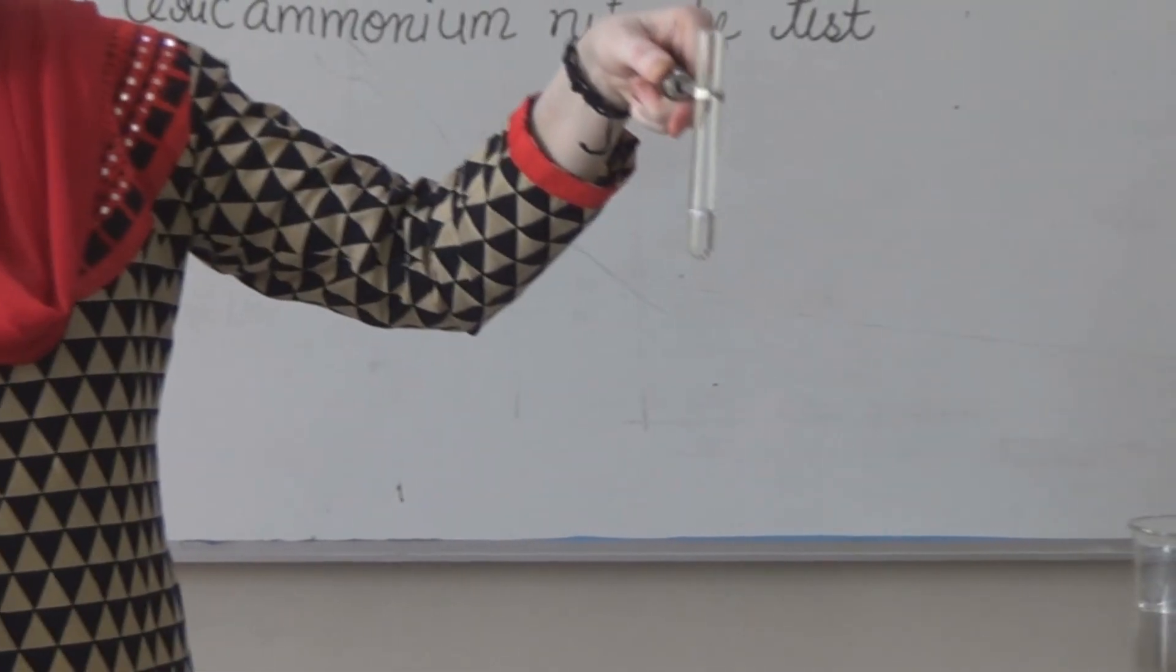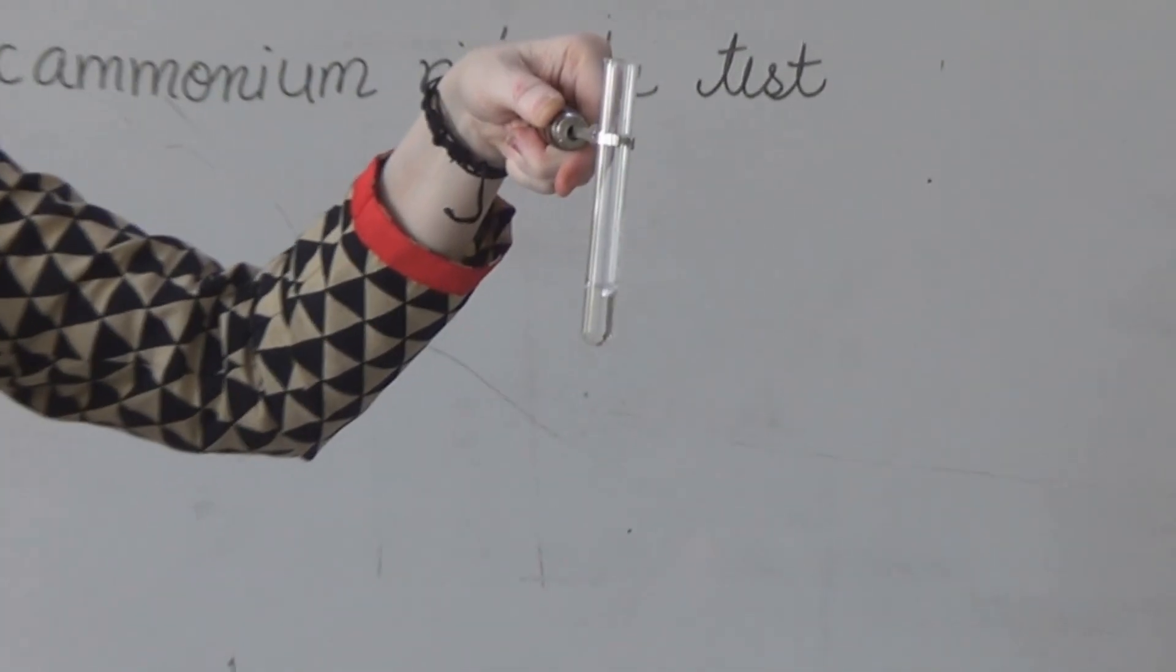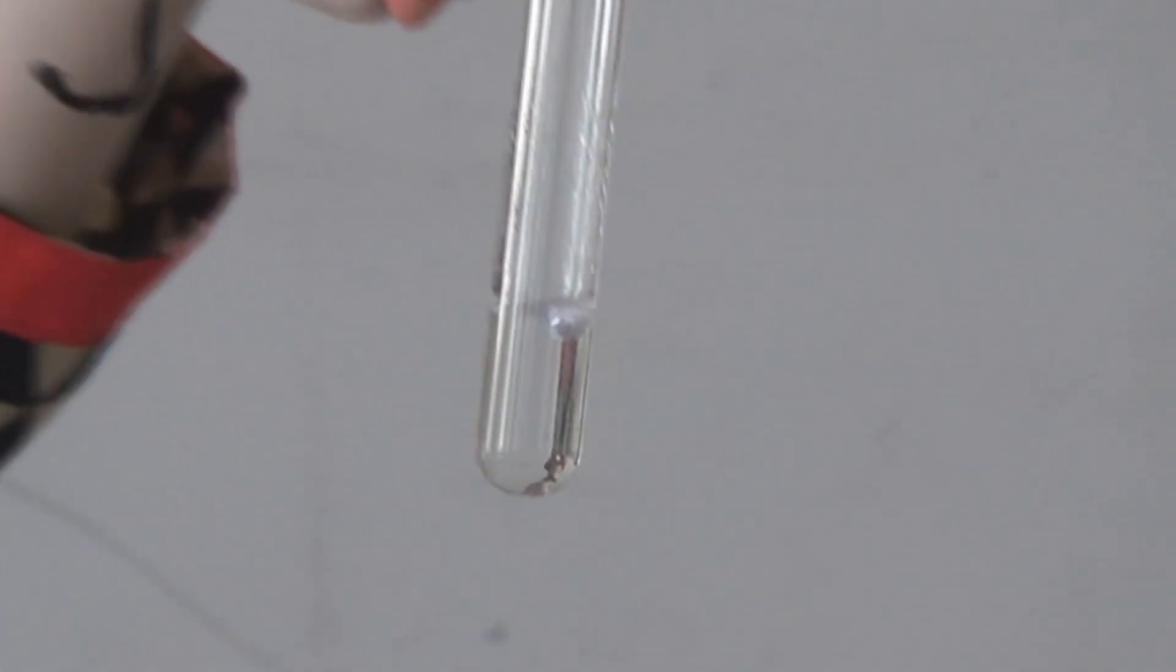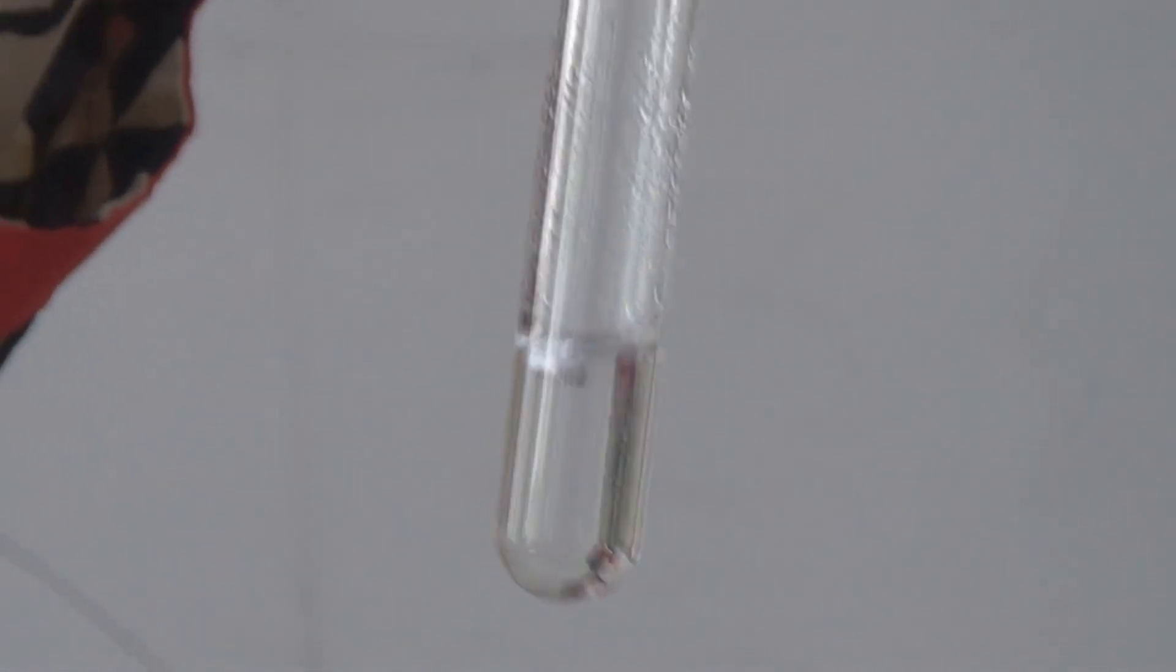Now you can see the brisk effervescence of hydrogen gas. This shows the presence of alcohol in the given organic compound.